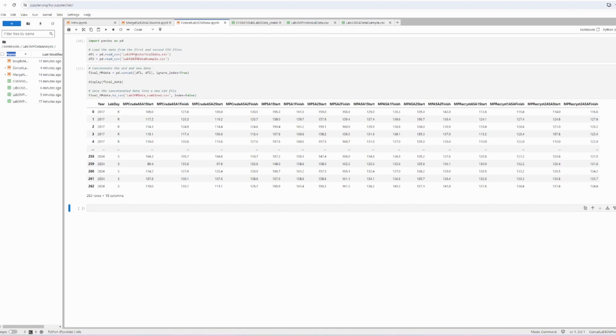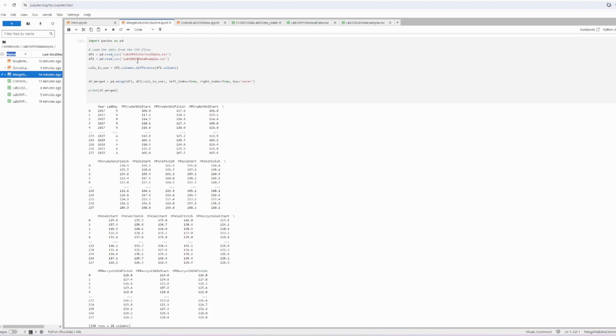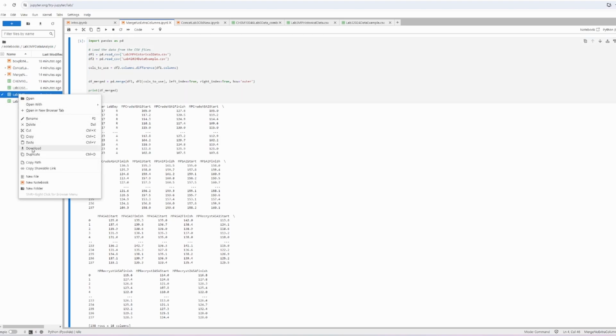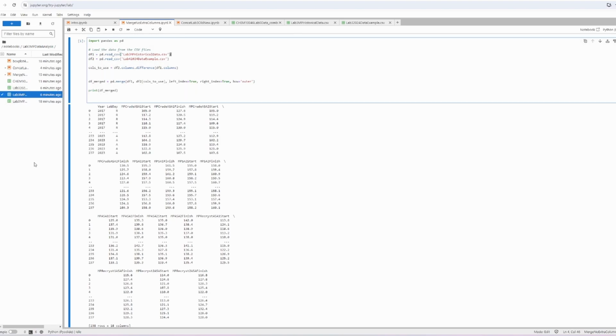And what I was able to do then was use this from a previous example. So here was the previous example. I needed to input the new path here. So what I was able to do is go here, copy path, and then highlight this and do Control V, and that will place it in. Since you're in the same notebook, their data's in the same notebook, I don't need any of this information here. It's a little bit extra, and I can delete that, and there it is.